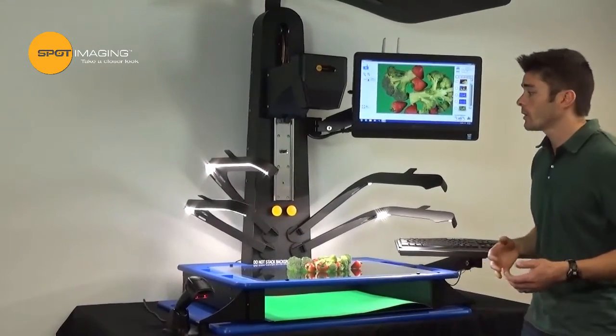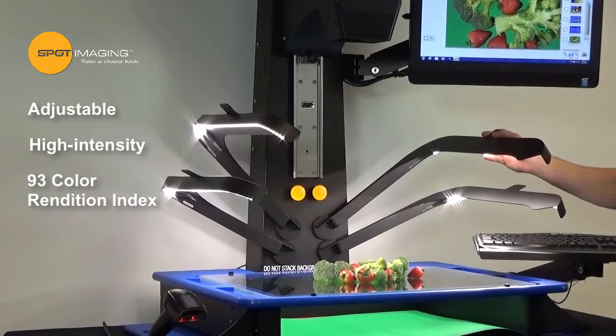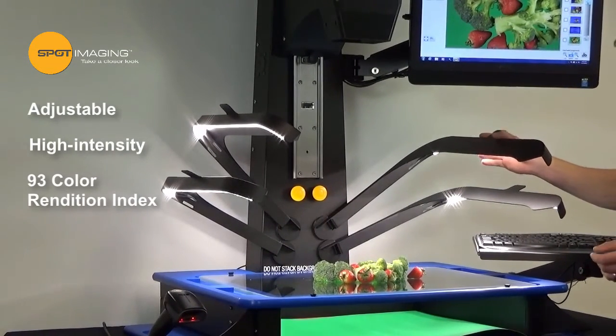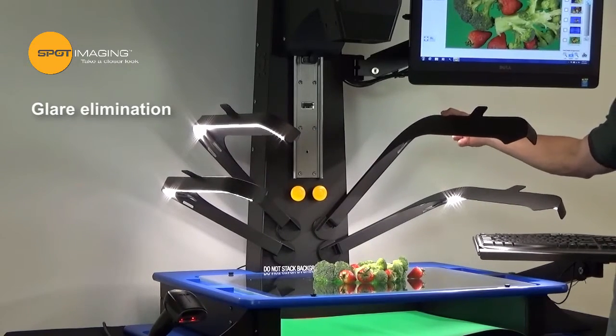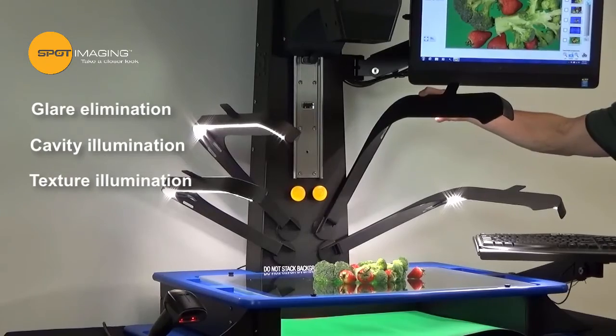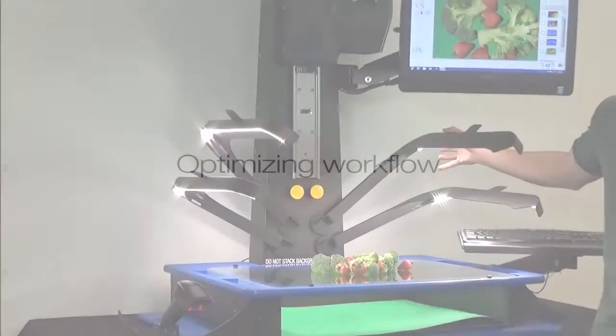What we came up with is four independently adjustable high intensity 93 CRI LED light arms. These can be adjusted to mitigate glare on a wet specimen, illuminate cavities from overhead, or provide side lighting for highlighting texture and topography.